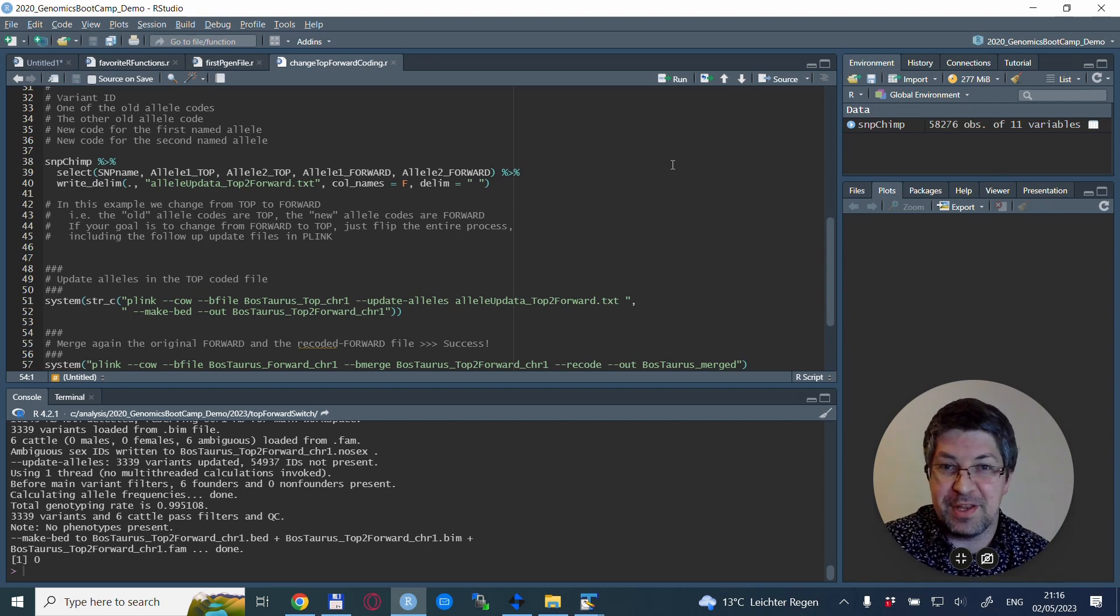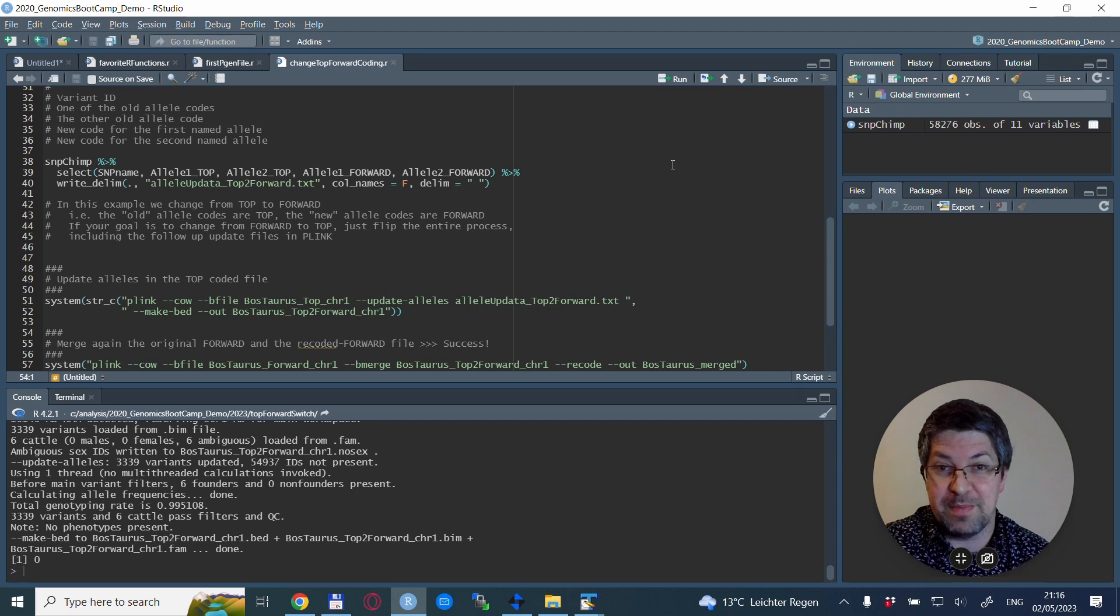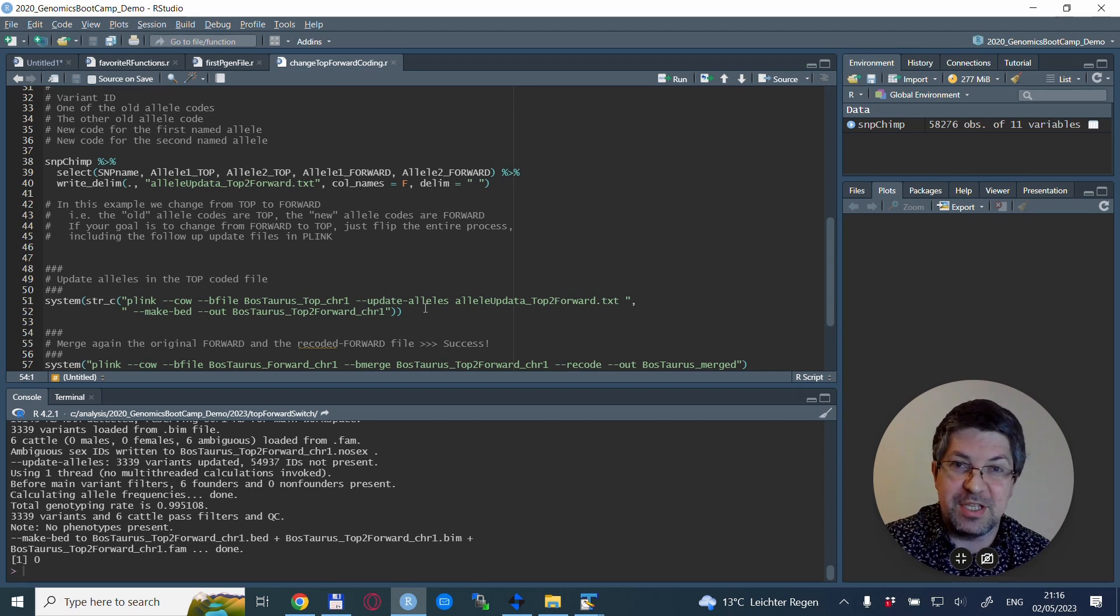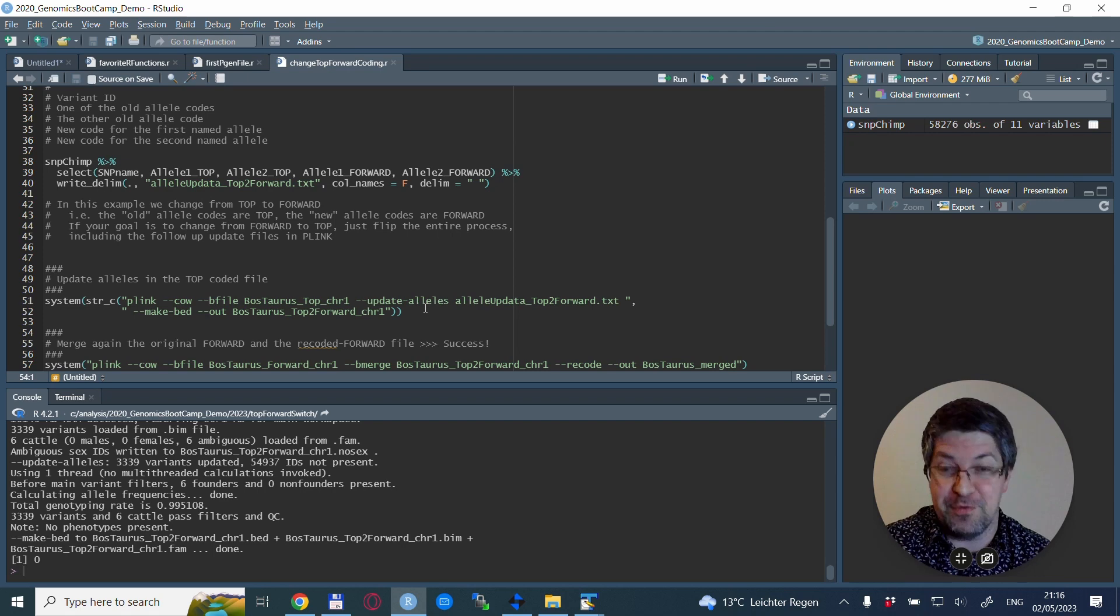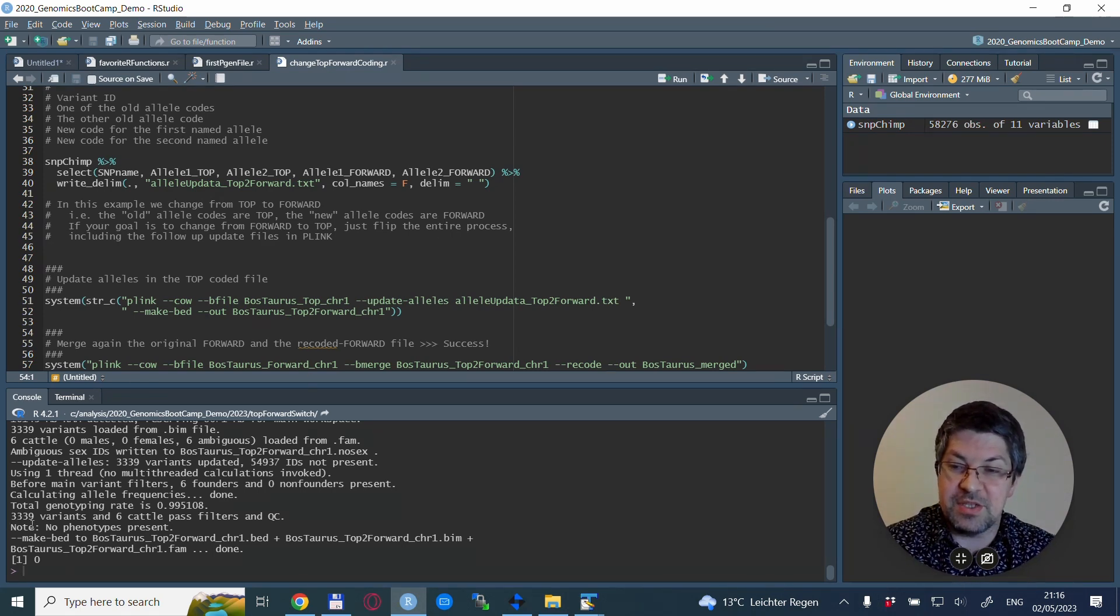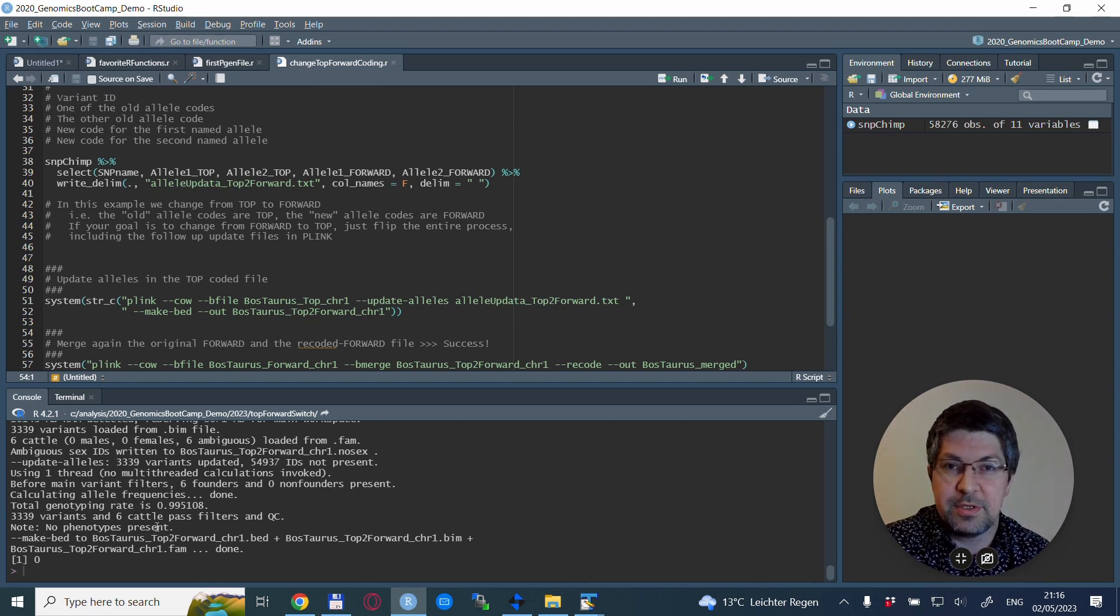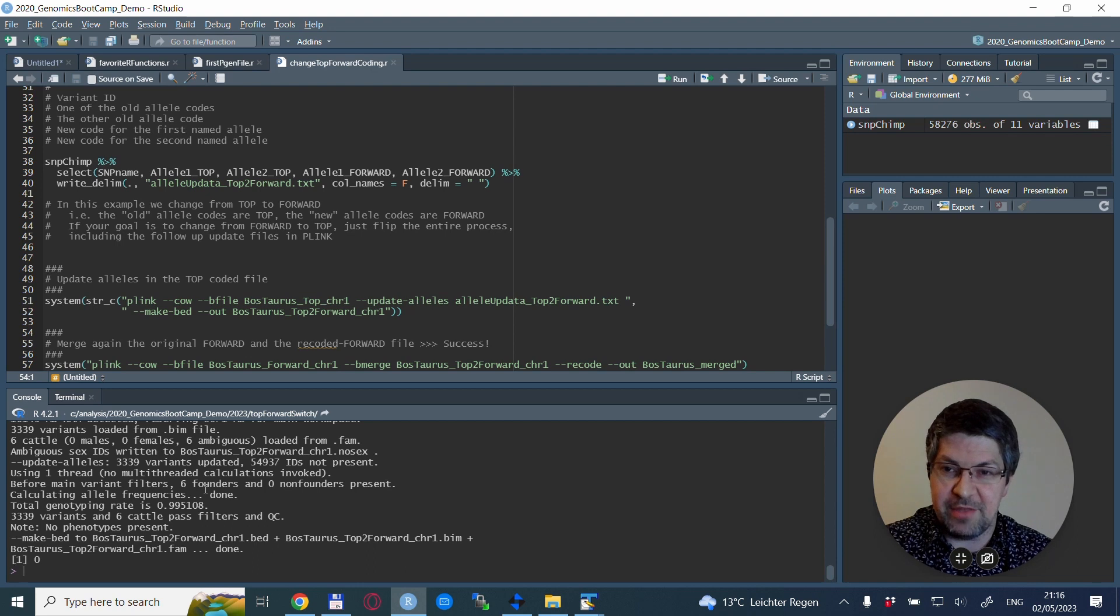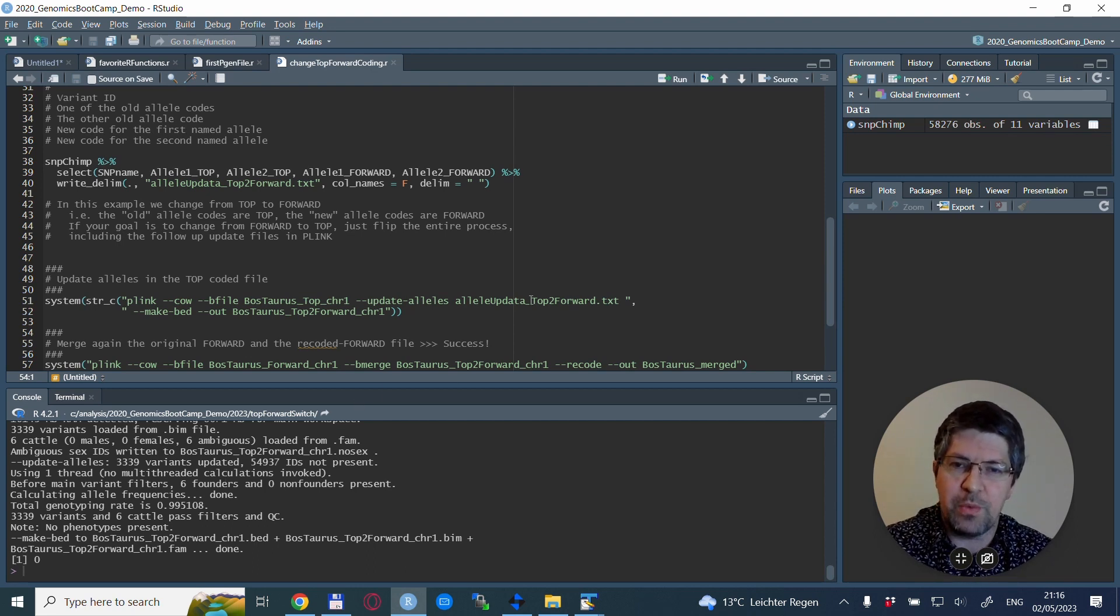Running this, PLINK has updated the alleles. I have to correct myself because the full chip has 54,000 SNPs but we're dealing just with chromosome one which has only 3,339 alleles. But it doesn't change the fact that the update was successful and now we have this file coded in the forward coding.